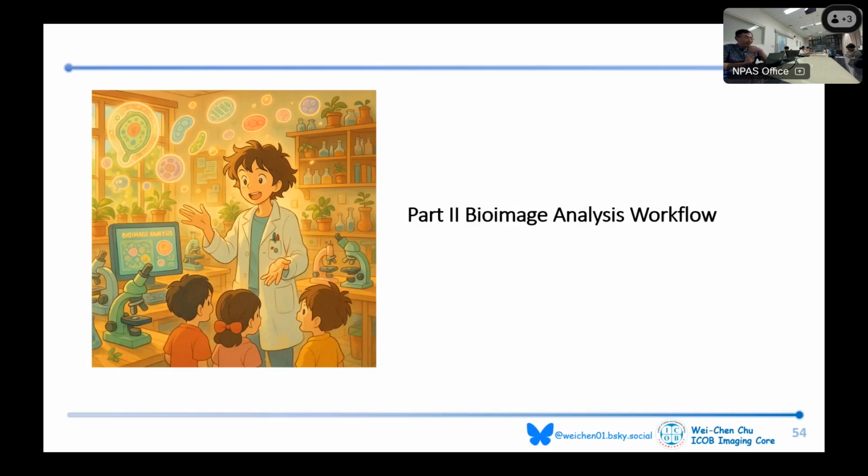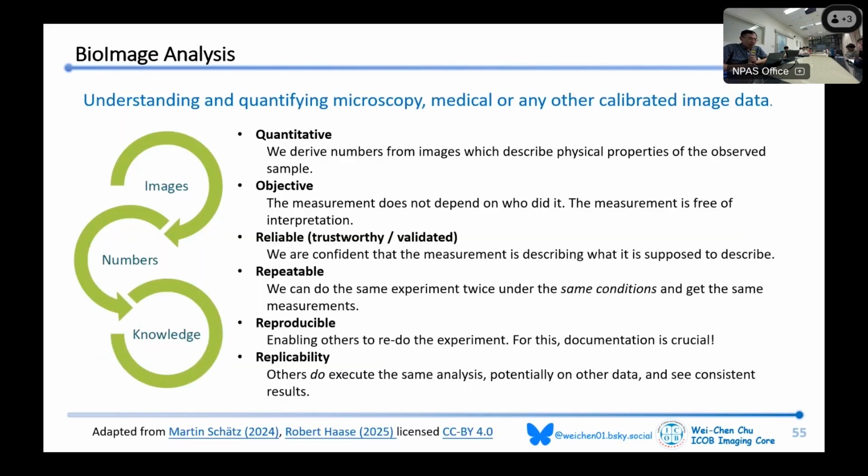Okay, let's continue with the second part. In the second part, I'm going to talk about the bioimage analysis workflow. Bioimage analysis is trying to extract numbers from the image and convert those numbers to knowledge.